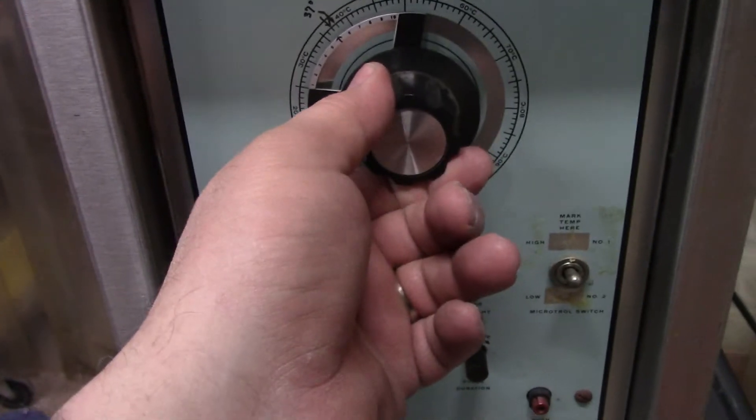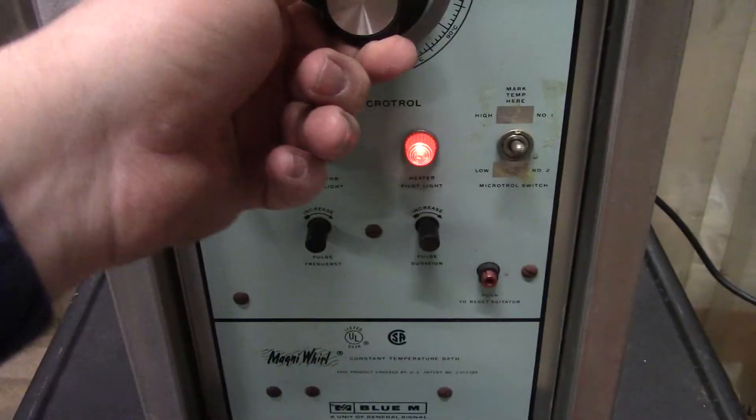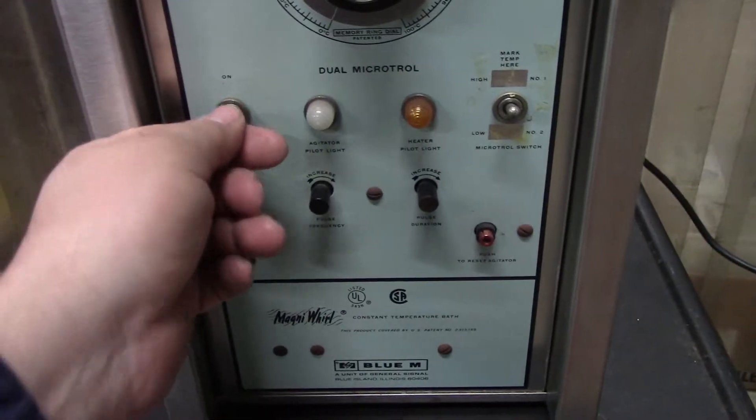Internal thermometer. You set the set point by turning the dial. On-off.